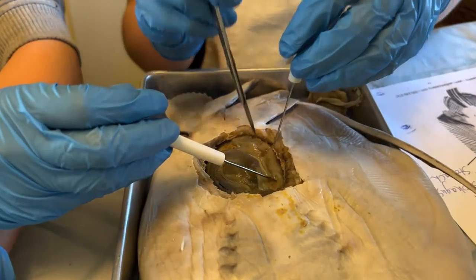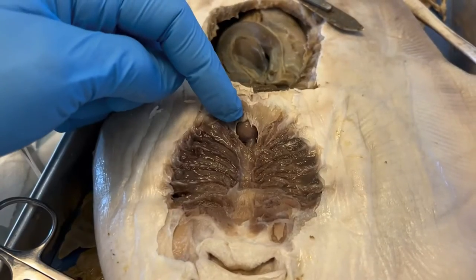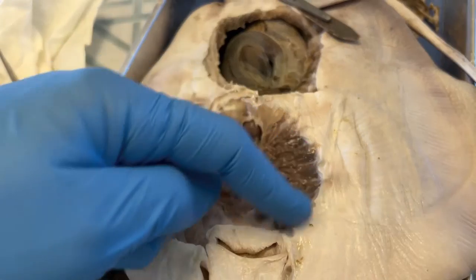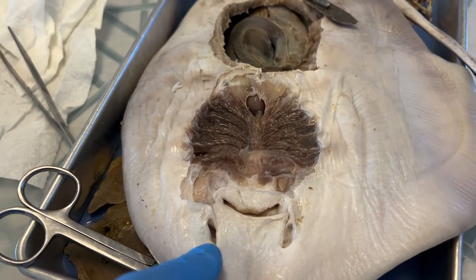Intestines, and we're trying to find the spiral valve. You can see down here that the heart is more posteriorly, and the gills are up here near the mouth where the nostrils are on the ventral side.